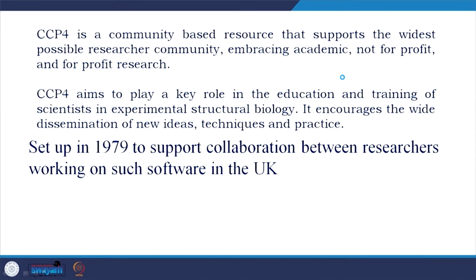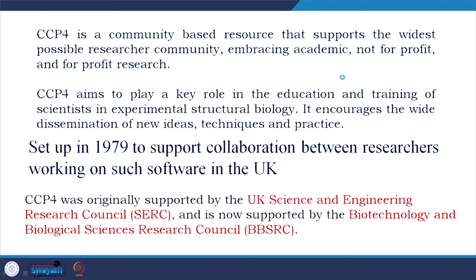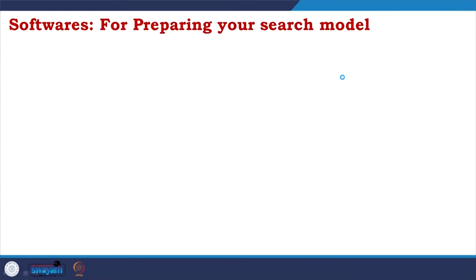Set up in 1979 to support collaboration between researchers working on such softwares in the United Kingdom, CCP4 was originally supported by the UK Science and Engineering Research Council, which is SERC, and is now supported by the Biotechnology and Biological Sciences Research Council, which is BBSRC.